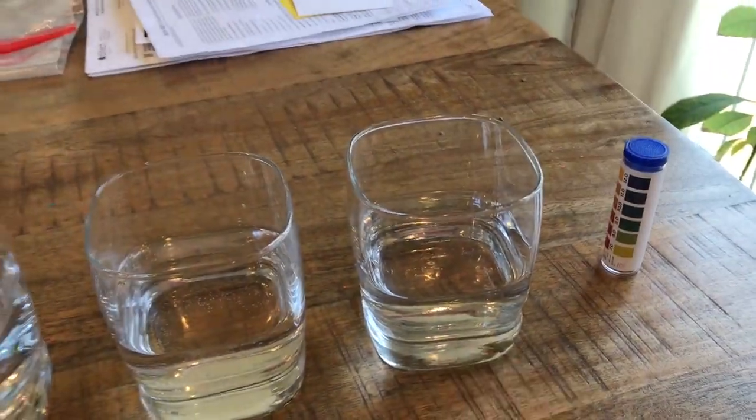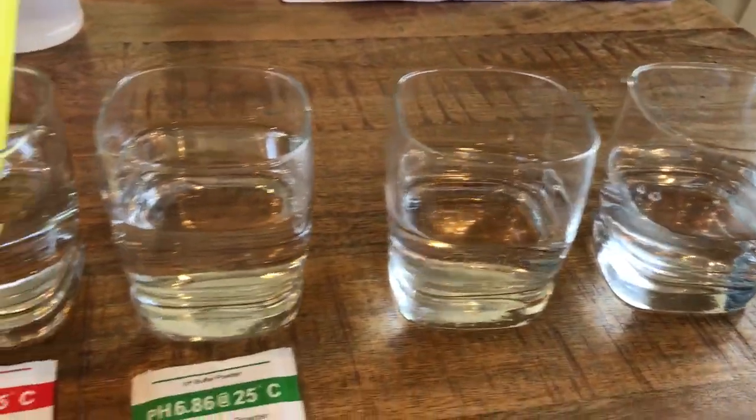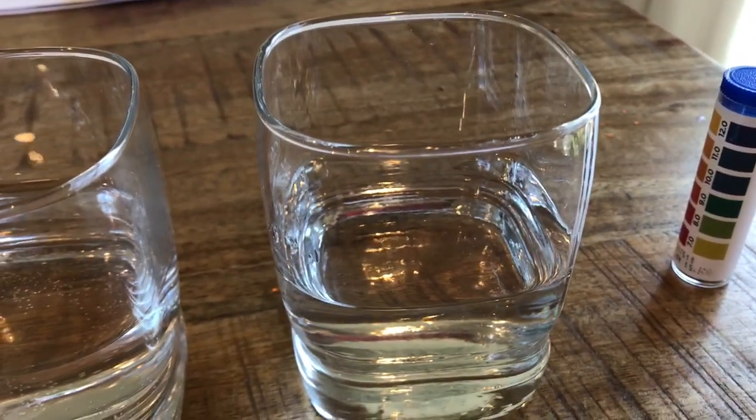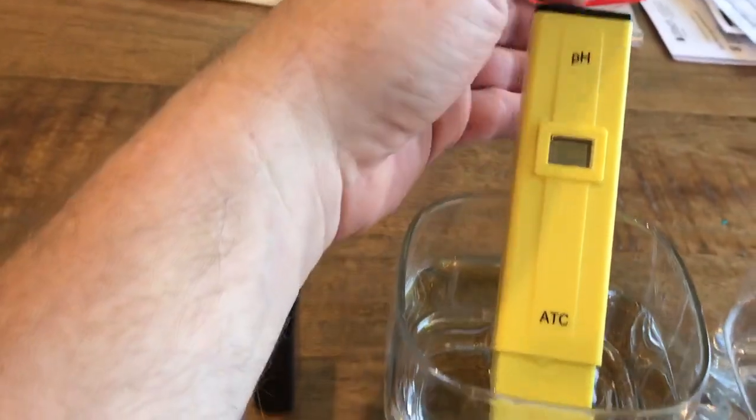It does say to wash the sensor in distilled water between tests, so I did that. But then I thought, well, distilled water has a pH of 7, so when I stuck the meter in it, it would not read 7, and it was driving me kind of nuts. I'll give a little test here and show you what's going on.